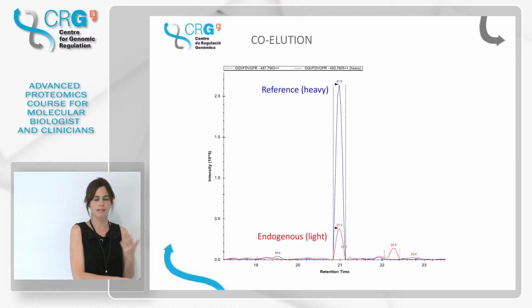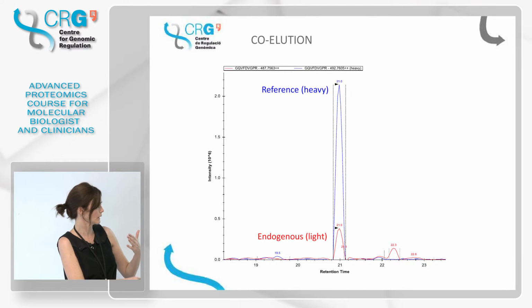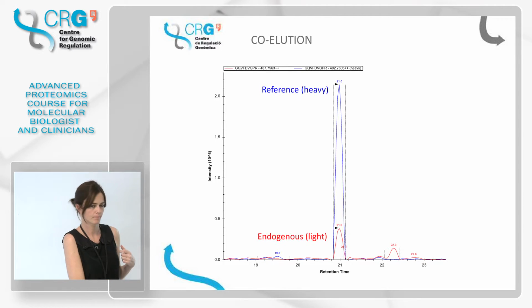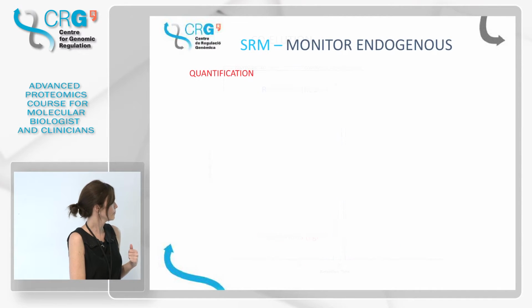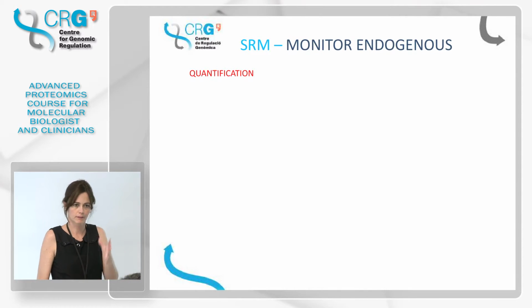This is a view that helps you a lot look for coelution. Because you have them separately, it's not so clear. So that's why we look at this in this way. We have only one signal, but this is the addition. And then here, you don't get the name of the transitions, but the name of the peptide. Okay, then we make sure that we have the right peptide, everything is identified correctly, and then how do we quantify? Okay, you will be doing this afternoon also.